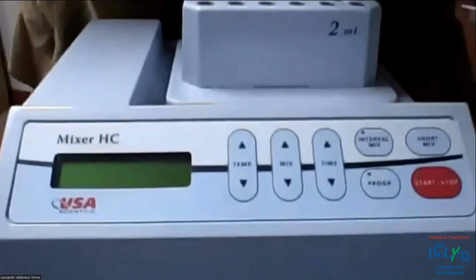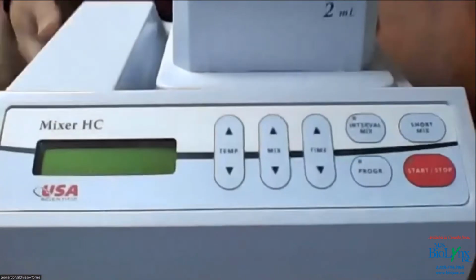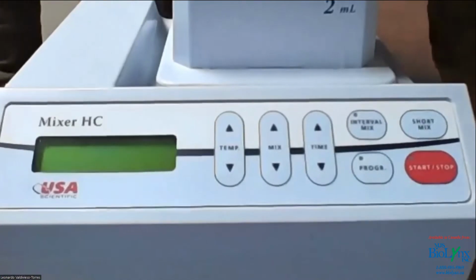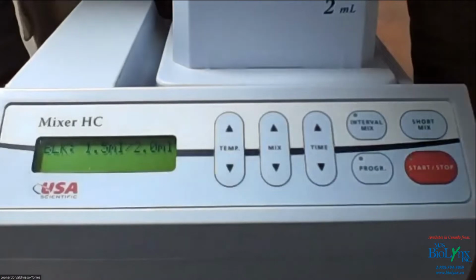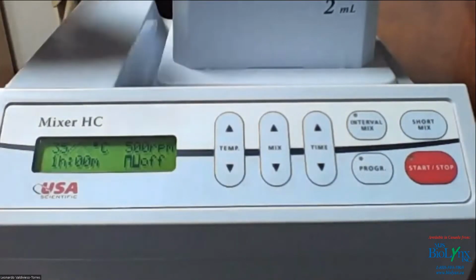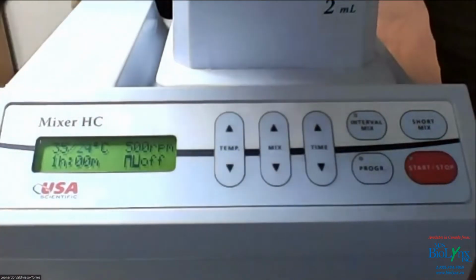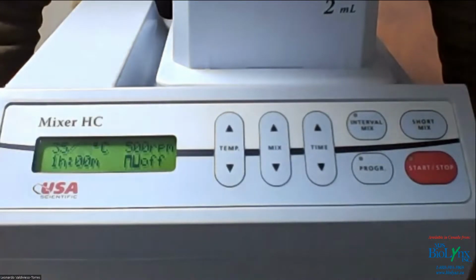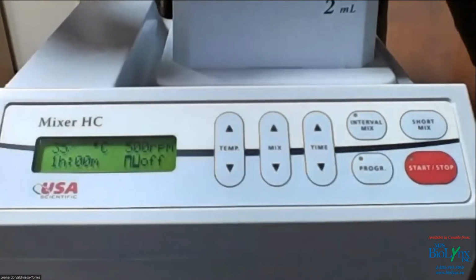And now I'm gonna highlight the digital display. Can you see the digital display well? Yes. Okay, perfect. You can see that it recognizes automatically the block. So if I had the other block, it would have said, say, a 50 ml block. So the first protocol that we're gonna do is an example like if it was reverse transcription, but we're gonna set it up at 30 degrees Celsius for 1 minute, and then we're gonna go to 35 degrees Celsius for another minute, and that's gonna be the program setup.